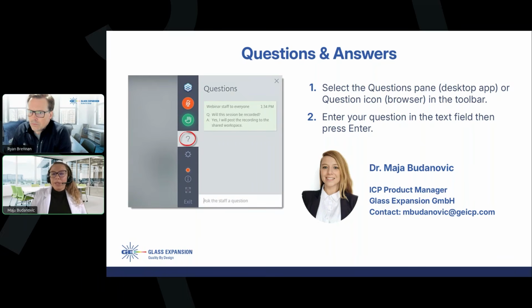If you have just the standard carbon fiber probe, and some kind of blockage really does happen, one thing I can think of that you can do is backflush. So basically by reversing your pump in the other direction to try to remove it. And if it's at the tip of your sample probe, you can also try to soak it in a surfactant or diluted detergent solution.